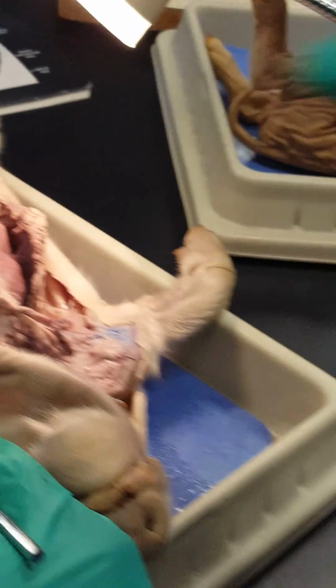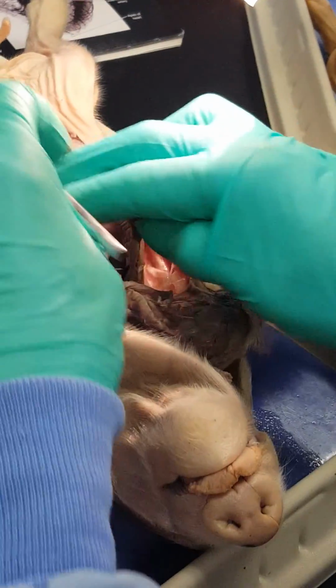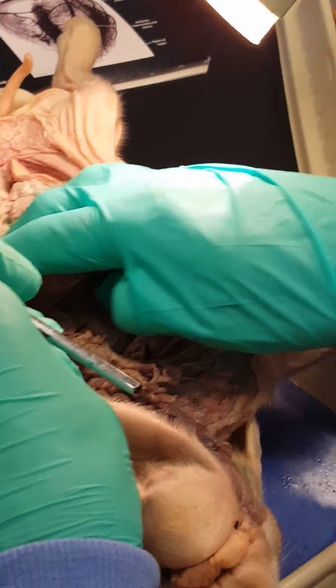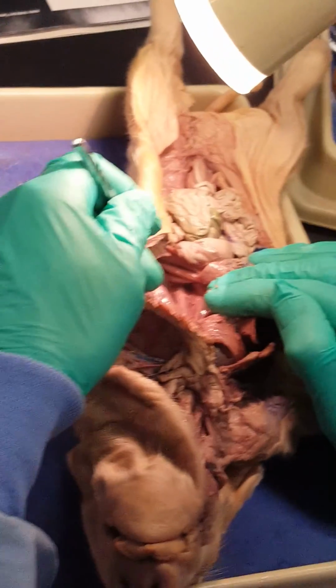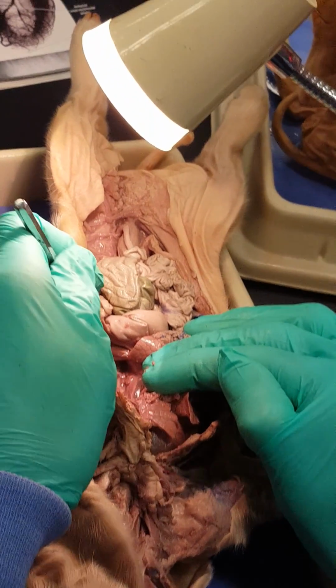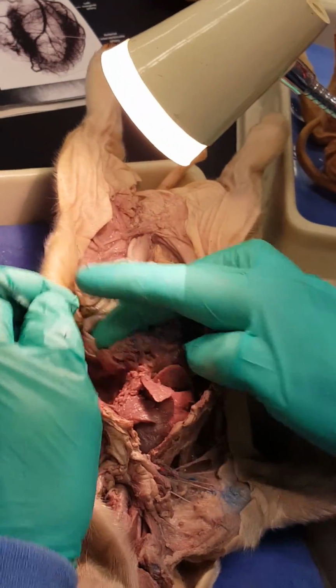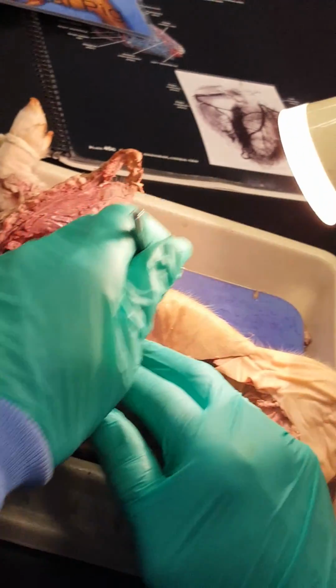So after the three great vessels come off, the dorsal aorta then bends down through the back of the thoracic cavity, and we can see it here, coming down from the arch of the aorta, and it'll penetrate the diaphragm and show up down here in the abdominal cavity.